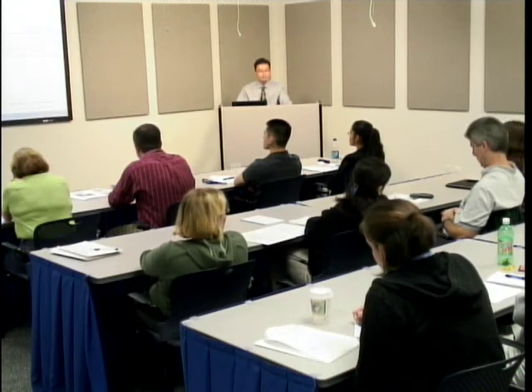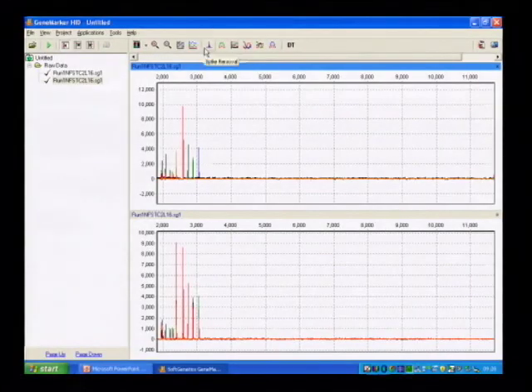When you were going through and processing the data initially, you were pressing all sorts of buttons up the top. Could you explain what you were doing? Yeah, each piece of allele calling software is different, and they all have functions that can be used. In this software, there's spike removal, saturation control, smoothing, baseline subtraction, auto pull-up removal, and manual pull-up correction. In the trace processing software that I've implemented for GeneBench, I've only implemented the color correction part, so color correction and baseline subtraction.